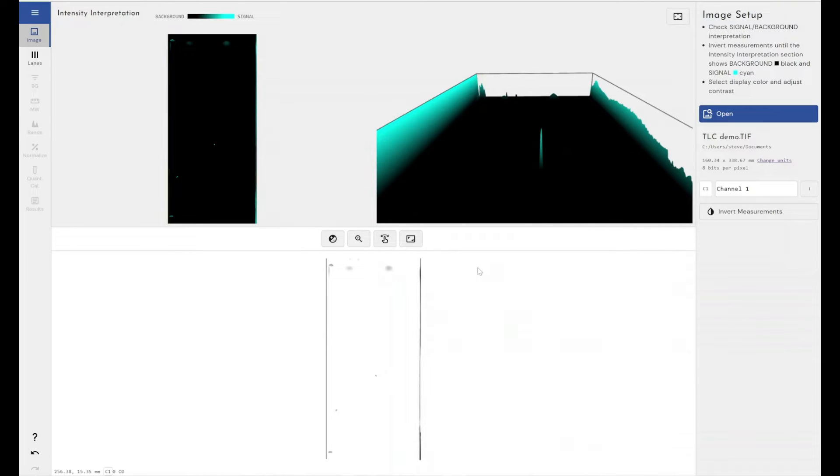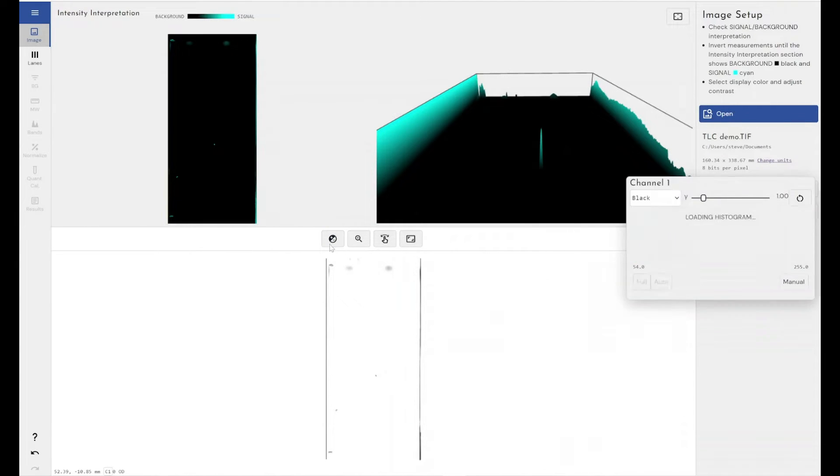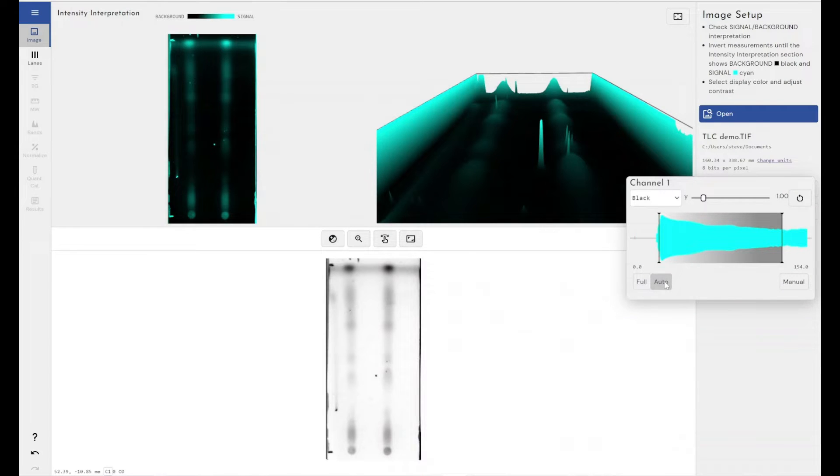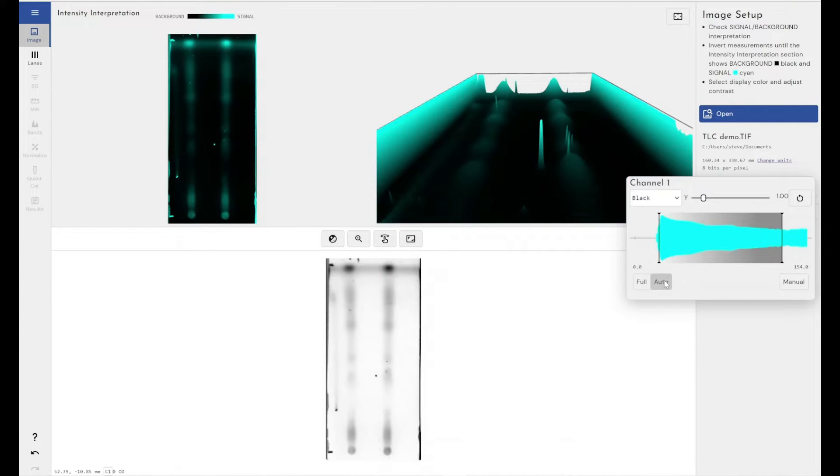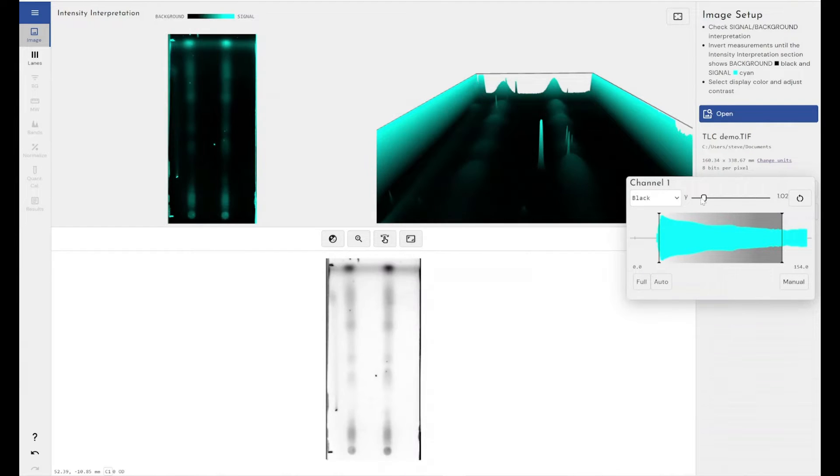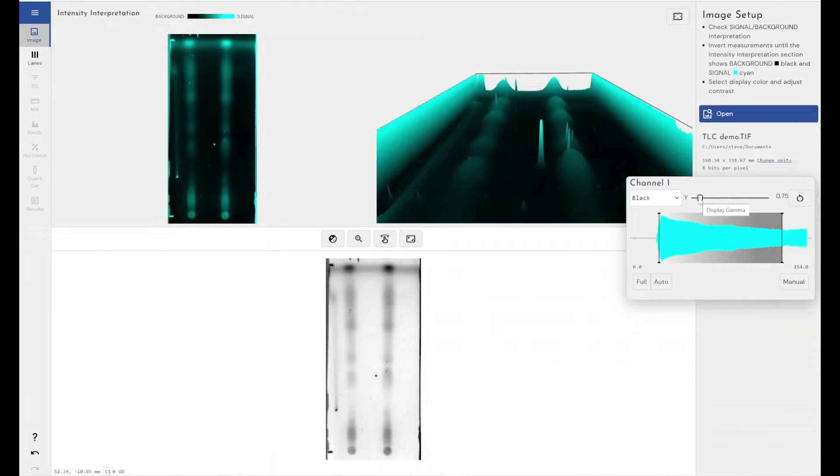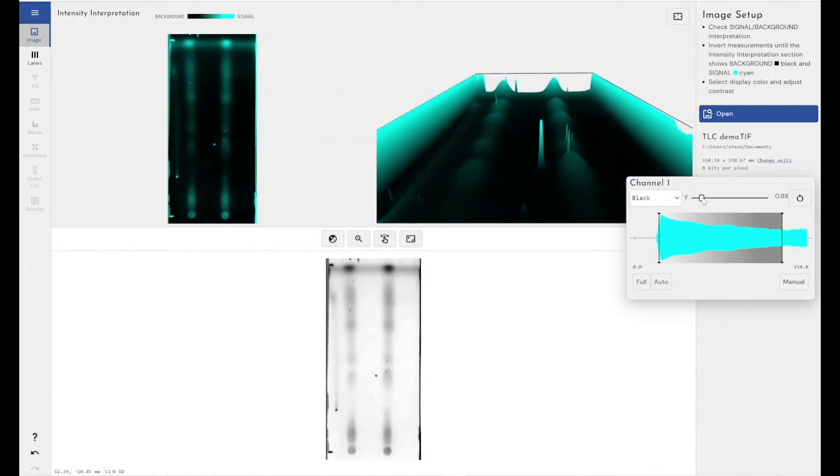So this gives me a good opportunity to show you the contrast and false color tools that are built into Phoretix to help you visualize images better. So let's click auto contrast. Let's see if the full contrast is a bit better. No, it's a bit washed out. So if I go for the auto contrast and if I just drop the gamma down a little bit you can see I'm getting much better resolution of my spots. There we go. That's a lot better.